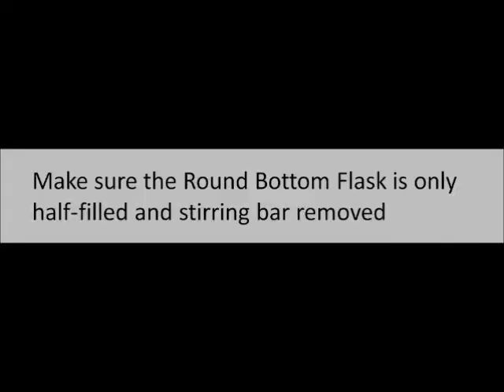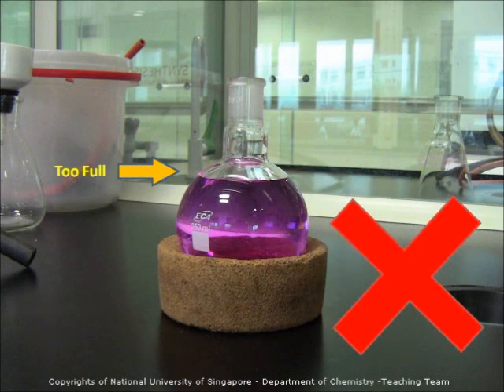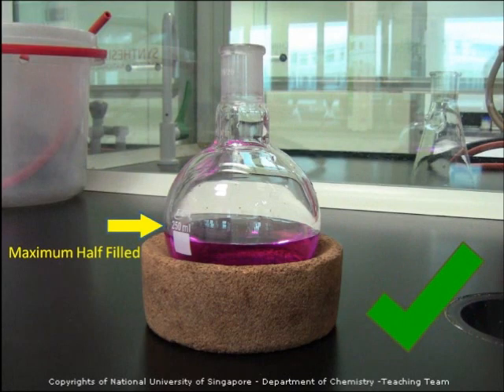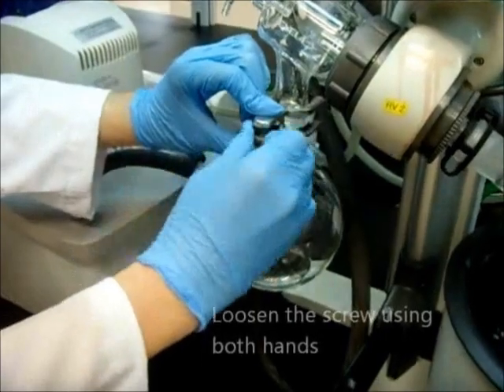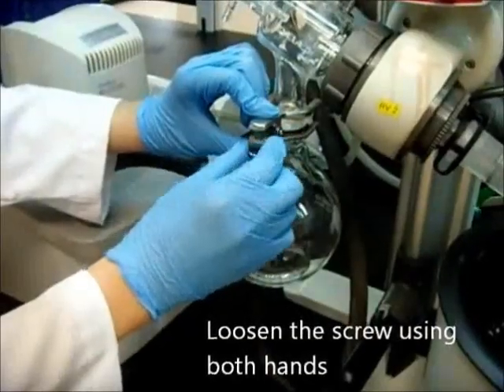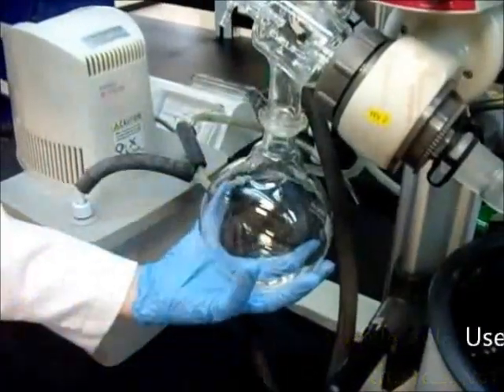Make sure that the round bottom flask is only half filled and the stirring bar is removed. Before you start to use the rotary evaporator, make sure that the solvent reservoir is empty. Loosen the screw of the clip at the receiver with both hands, then remove the clip while holding the receiver.